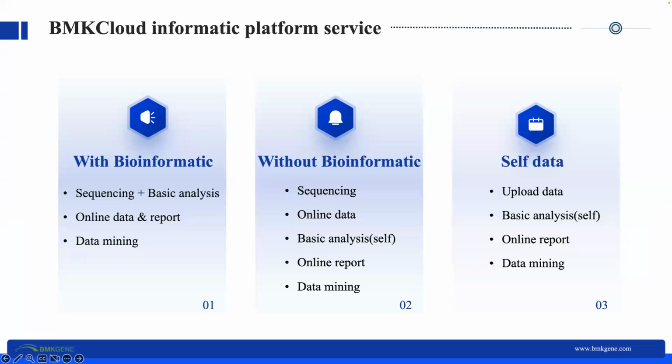So, how does BMKCloud provide service? Let's start from data. There are three situations. Number one, sequencing and analysis completed in-house. Number two, only sequencing conducted in-house without bioinformatics analysis. And number three, for users with their own data.